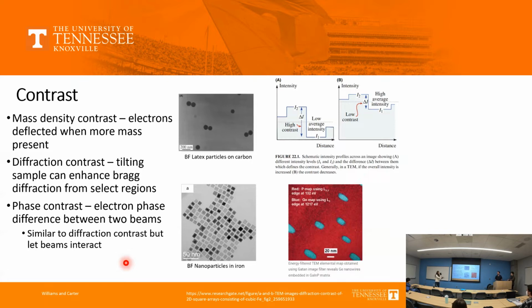So much coherent. The zone axis of both, which is very rare in general. In general, you see an orientation relationship, and if you see a clear orientation relationship, you will see the diffraction pattern overlapping. So this is the number one point, which is of top importance, especially to the research here. There is research going on actively in Brian's group and Winkle's group to examine coherent precipitates either theoretically or practically in a variety of nuclear materials. Any nuclear materials that we think we can put in, this is the first thing we test.